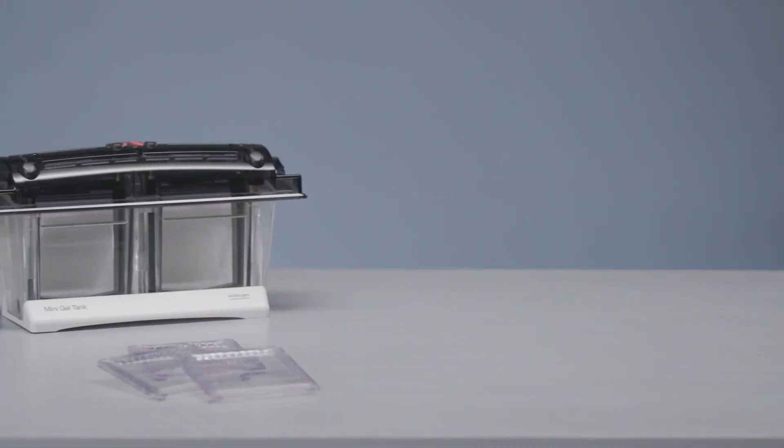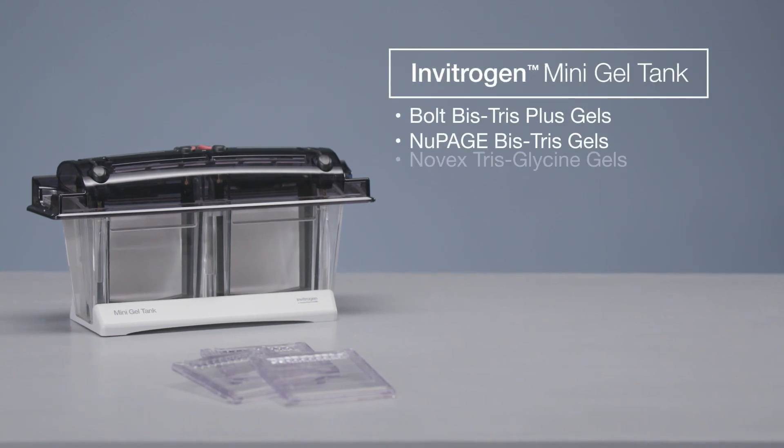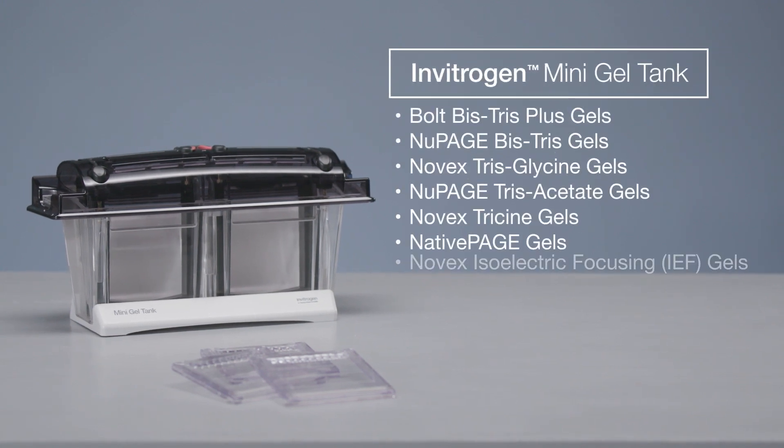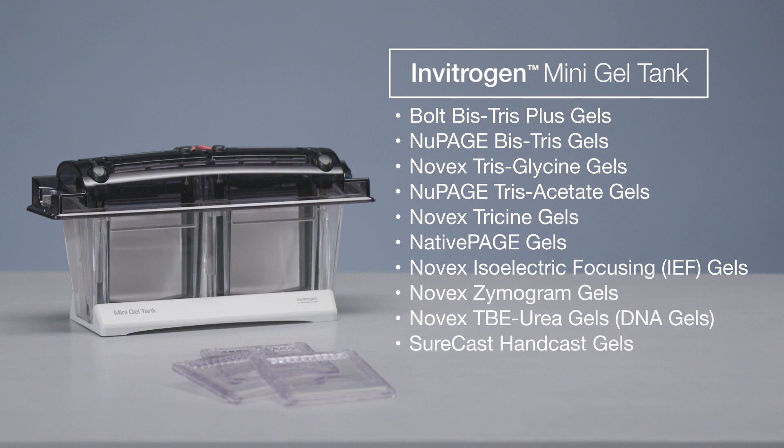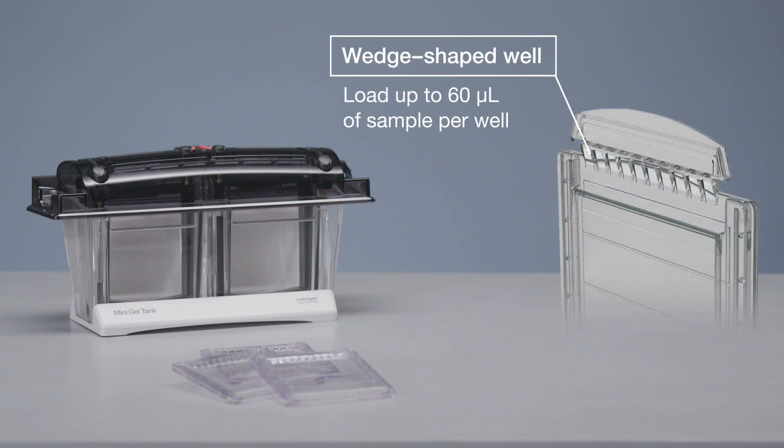This video will show you how to separate proteins by using the Invitrogen Mini Gel Tank, which is compatible with a wide range of precast and pour-your-own gels, and the Invitrogen Bolt BisTris Plus precast gel with a wedge-shaped well designed to enable the loading of sample volumes up to 60 microliters per well.